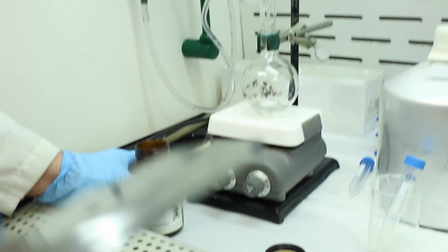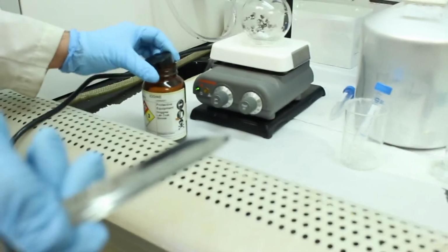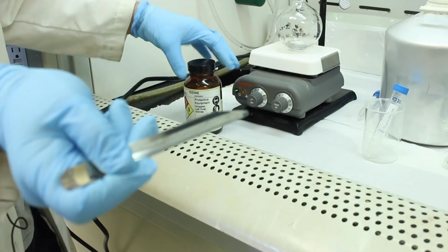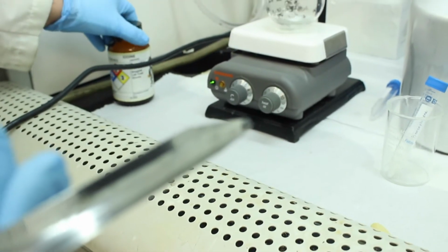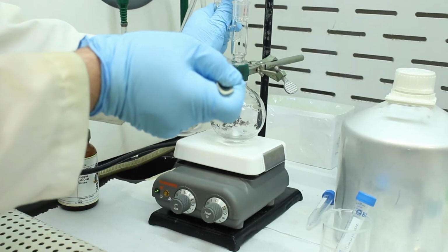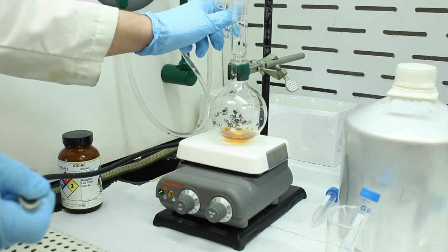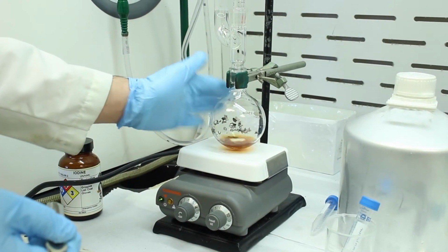So I don't know if you can see that, but it's very nice looking. Iodine is a pretty element. But when it goes into solution, it forms kind of a dirty brown, so it's not that nice to look at. Okay, so hopefully this will initiate our Grignard for us. So I'll take this Claisen head off and add the crystal quickly. So there we go. So you can see it immediately colored the solution.